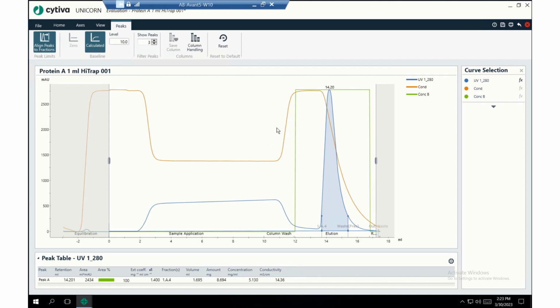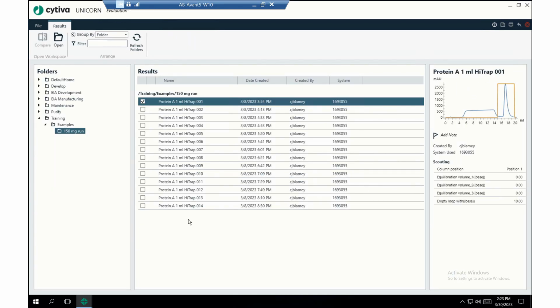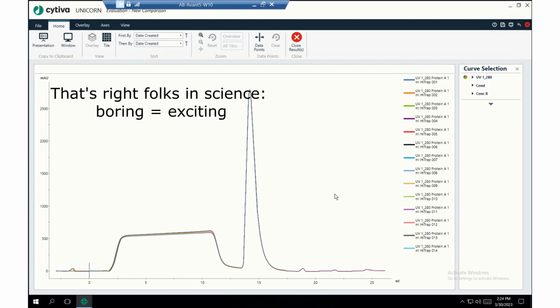All right, so now that we've had a look at that, let's look at the whole batch of them together. So I'm going to go to close results. I'm not going to save the changes. Okay, in order to do this, I'm going to hit the shift button to highlight all the runs, and then right click and open/compare curves. Sometimes this takes a second because it doesn't just load all the UV curves, it loads every curve. So here we go. You can see that all the curves are stacked up on top of each other. This is all 14 runs, one on top of the other. So this is a really good indication that we're doing something right here. It's also really boring, but for chromatography, that's the exciting part of it.